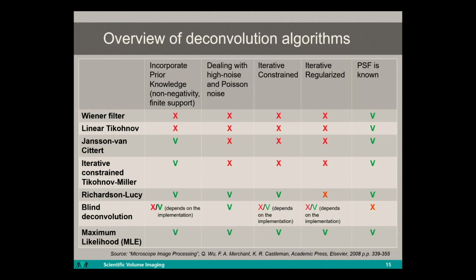Several deconvolution algorithms exist with the intent to improve image quality. Yet most of them cannot control for noise in a proper manner or are prone to clipping artifacts, because they do not take care of the a priori knowledge that negative values are not represented in an image.